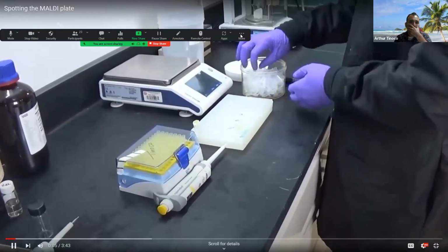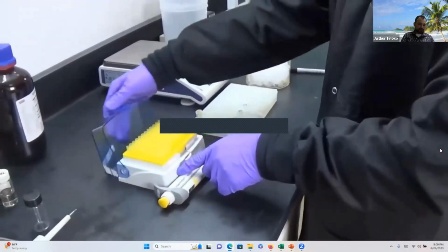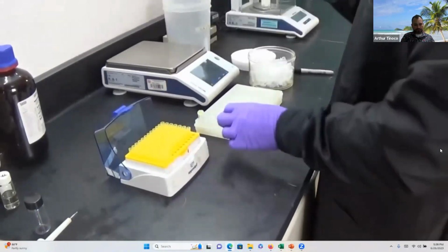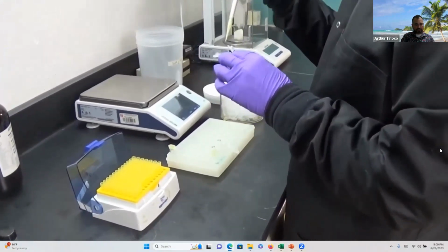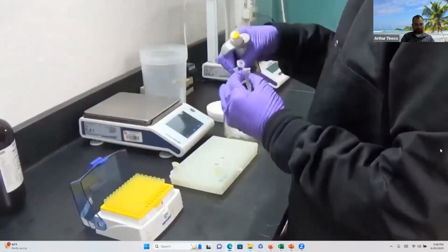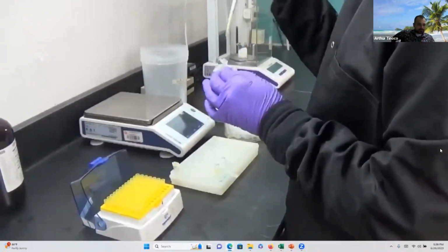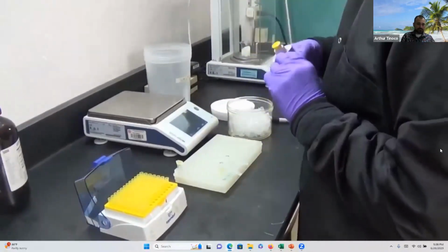It is time to prepare the sample solutions. I previously prepared a stock solution of a small titanium compound that comes from my laboratory. It is important that when you prepare your final set of solutions, you select a solvent that is compatible with the solvent used to make the matrix solutions. In this case, I diluted my stock titanium compound to 2 concentrations, 200 micromolar and 20 micromolar. I did this to have 2 different concentrations with which to analyze my sample.